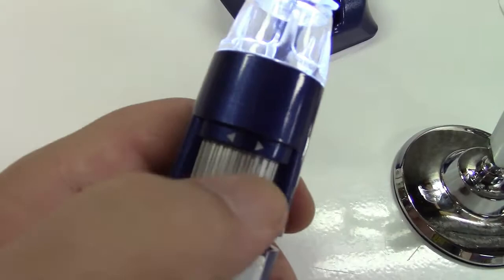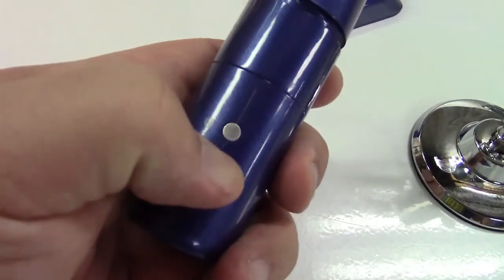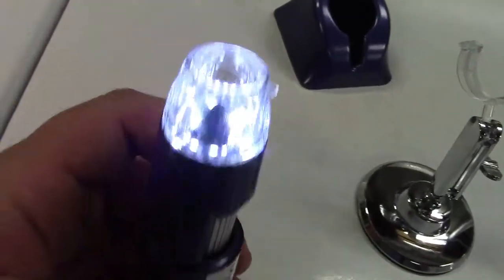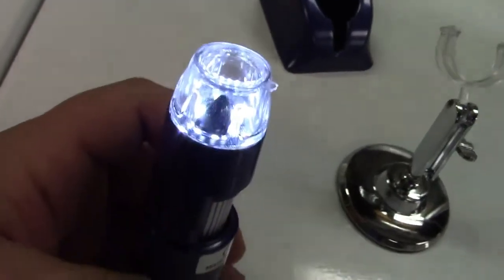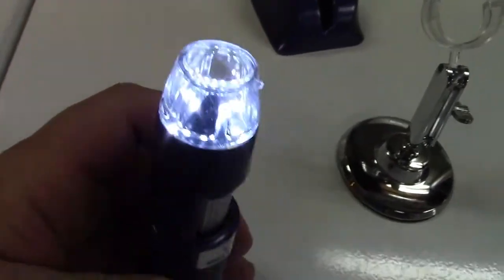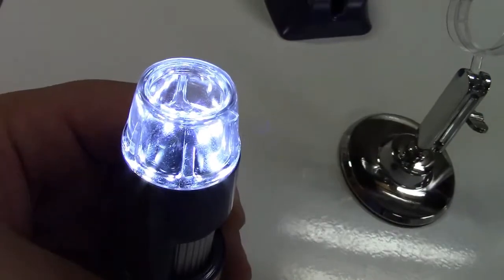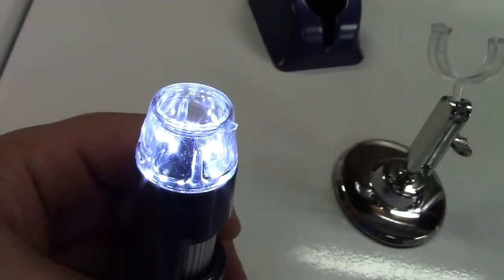On the microscope itself, you have this wheel here that will adjust the focus of it, and over here are your zoom buttons in and out, like that. The battery in here lasts approximately 3 hours and takes approximately 3 hours to recharge if you're going to be using the LED lights. So now I'm going to go ahead and get this hooked up to the computer.